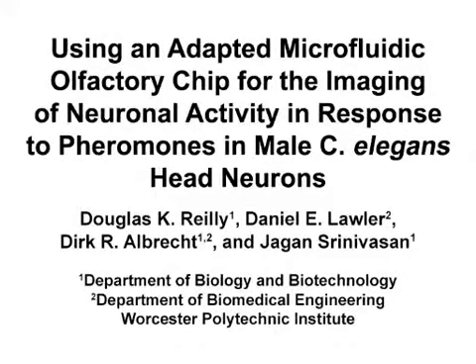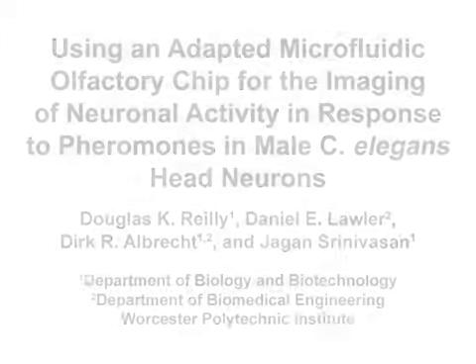The overall goal of this procedure is to efficiently trap and image calcium transients in male C. elegans head neurons upon exposure to pheromones. This method can help answer key questions in the neurobiology field, such as understanding sex-specific neural circuit regulation.